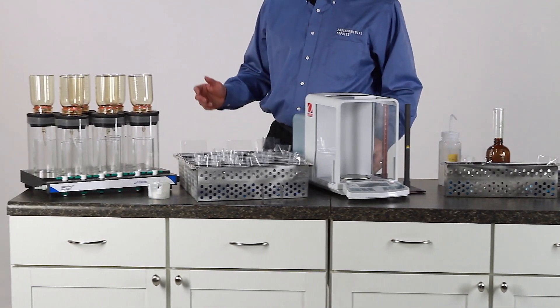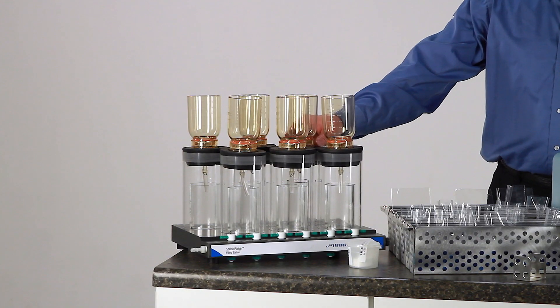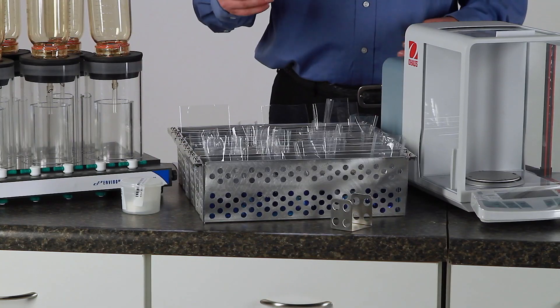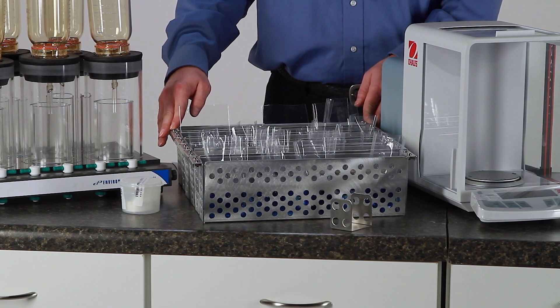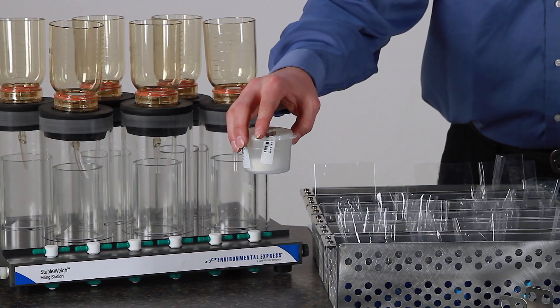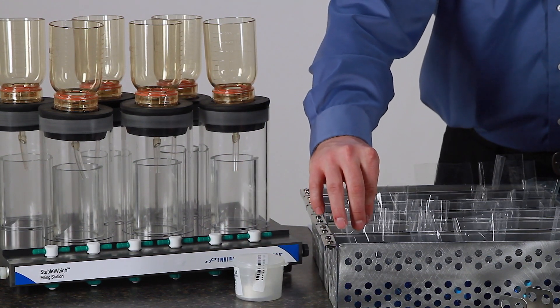Over here we see the contents of the Environmental Express Stable Way Startup Kit: the six-place filling station, which comes with enough 300 milliliter, 47 millimeter filtering funnels to accommodate the entire rack, and a five-place modular rack that you can build to fit your oven size and your desiccator size, which will hold up to 25 Stable Way vessels. It will come with a 100 pack of washed and dried ProWay filters as well as a 100 pack of the vessels themselves.